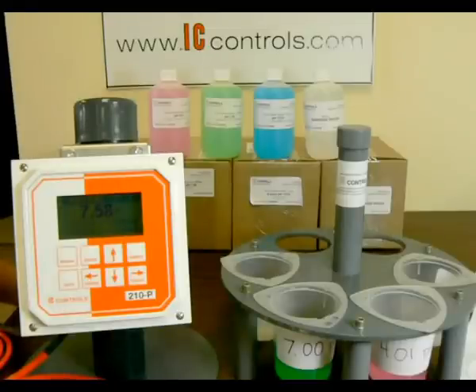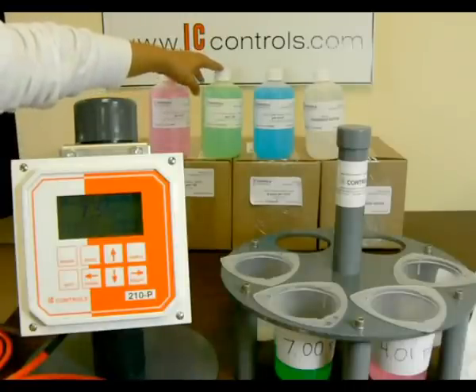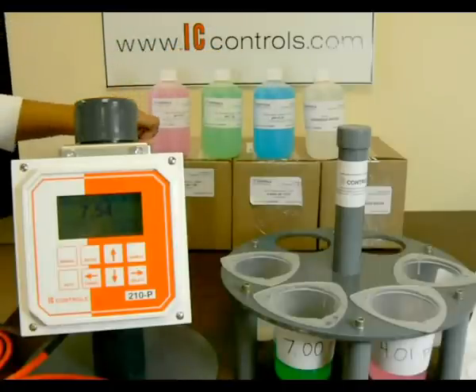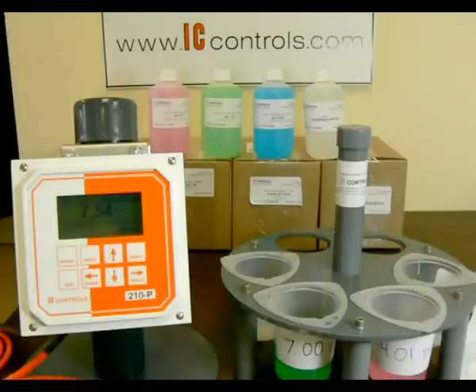It includes a pH 4 buffer color-coded red, a pH 7 buffer color-coded green, and a pH 10 buffer color-coded blue. Also included is deionized water. IC Controls pH calibration kits ensure accurate and reliable results while making the technician's job easier.